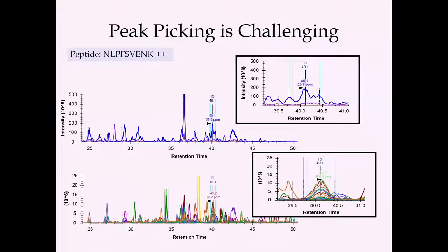The MS1 data is completely confounded by other things at that mass, and you can't really distinguish it from the background at all. The MS2 data, in this case, is noisy, but there are definitely transitions that allow you to integrate the area under the curve. But just picking this signal, this retention time, out of the data without a standard would be pretty hard. But we actually happen to know a lot about these peptides. We know the retention time, we know the fragment ions, et cetera.